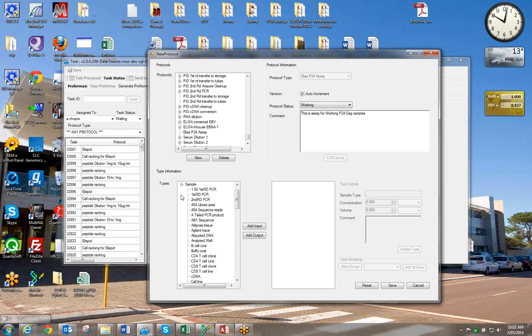Now the reagents that get added in. The first thing I added is the sample type. For P24 you're going to need cells, isn't it? Yes. So I would use a cell line and add that as an input. I could have a cell pellet as an alternative, or just the cells. It could also be serum or plasma. If it was serum or plasma, then we just choose plasma and add that as input. I'm going to remove these if they're not needed. If you accidentally added something, you can go and delete the type. Okay, so let's say it's plasma or serum.